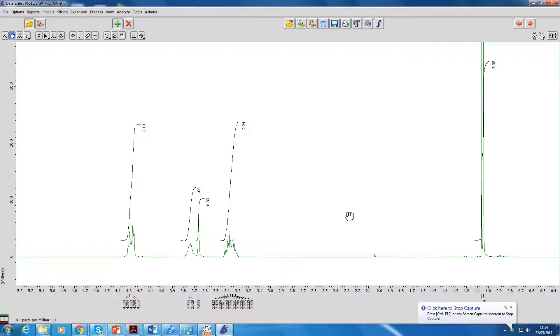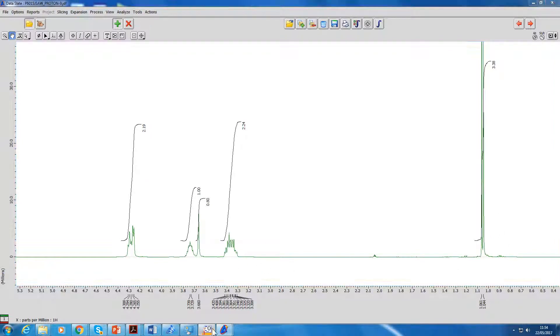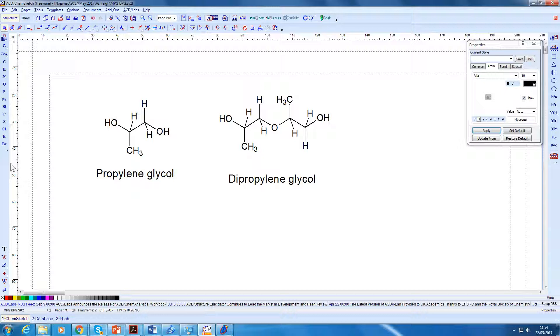This is part two of the Delta NMR software and we're going to look at overlays now. So this is our spectrum of MPG. If I go back to the structures, this is propylene glycol.